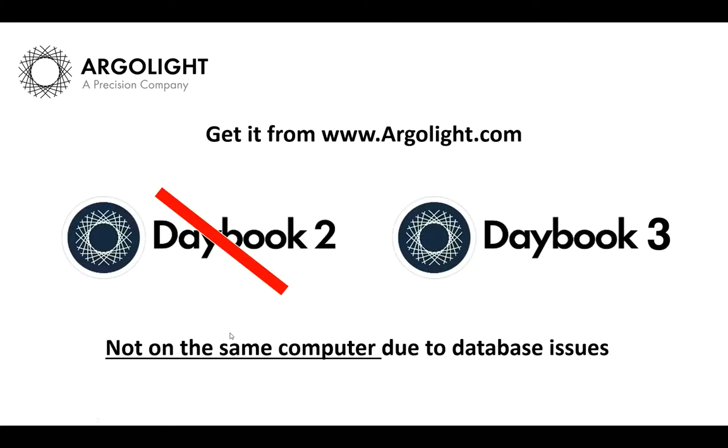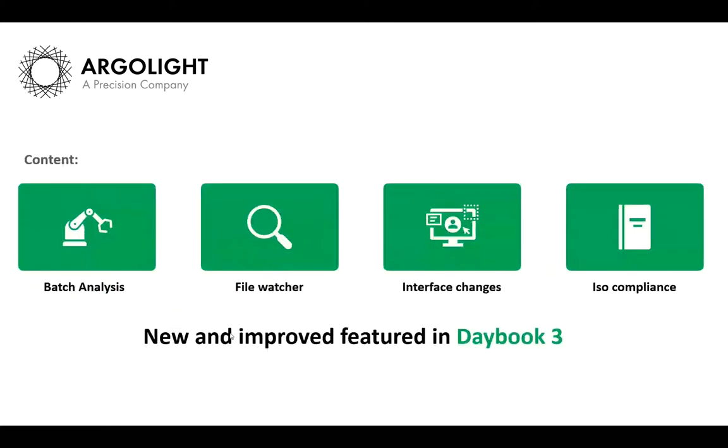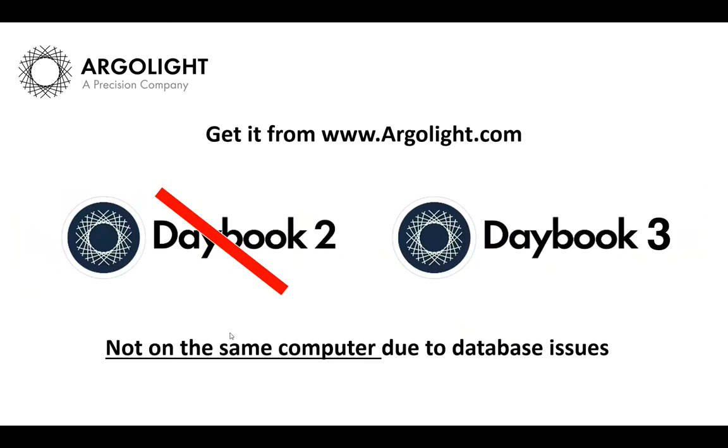So first of all, before going into the new feature I will present, I will introduce the new software. Daybook 3 is the new version of our Daybook software. It is a new software, so it does not update automatically from Daybook 2. Therefore, you need to install Daybook 3 on your computer to get access to the new features.